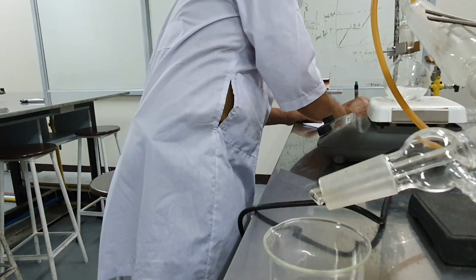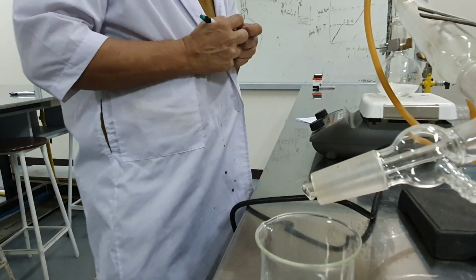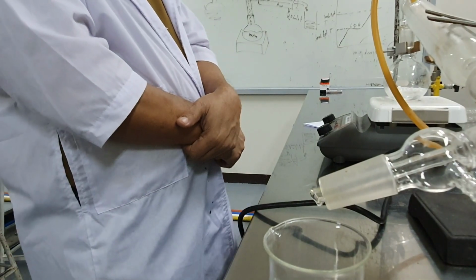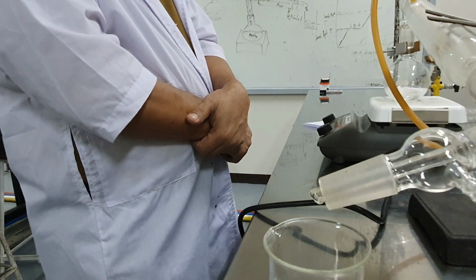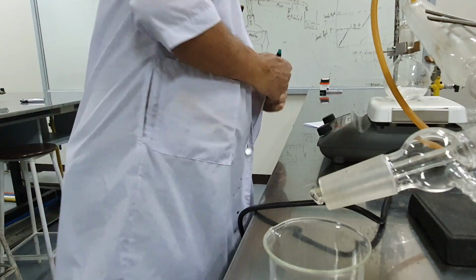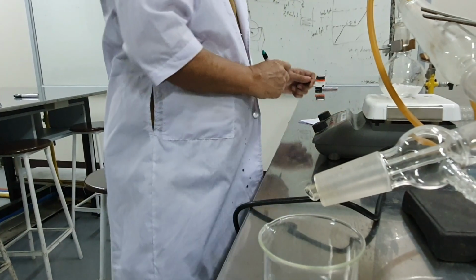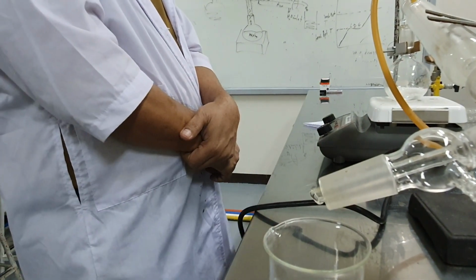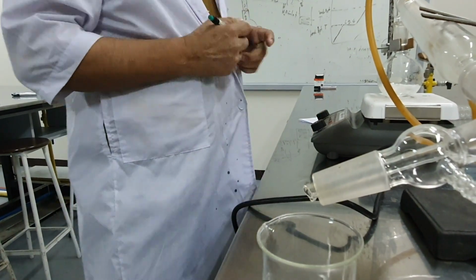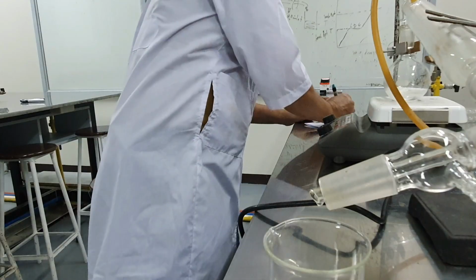Okay? So, it went down a bit, 62 degrees. So that is 63 again. So that means pure is coming out. Okay, still 63. So still 63.